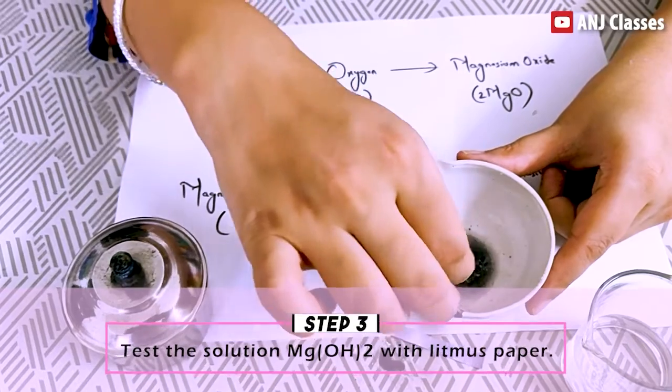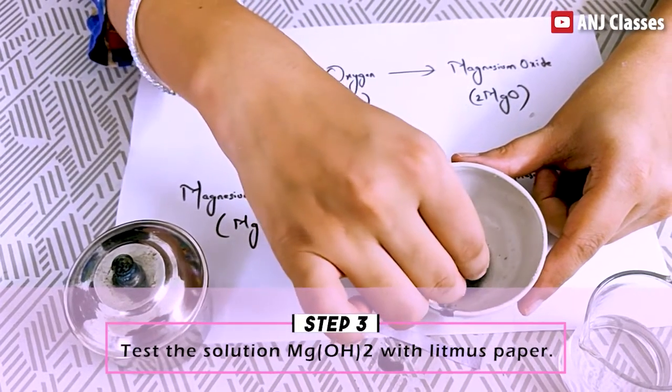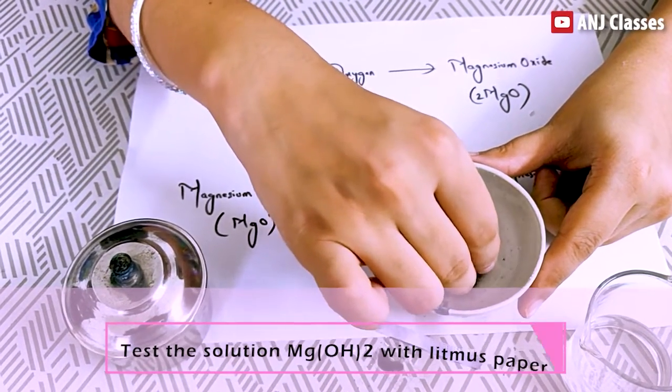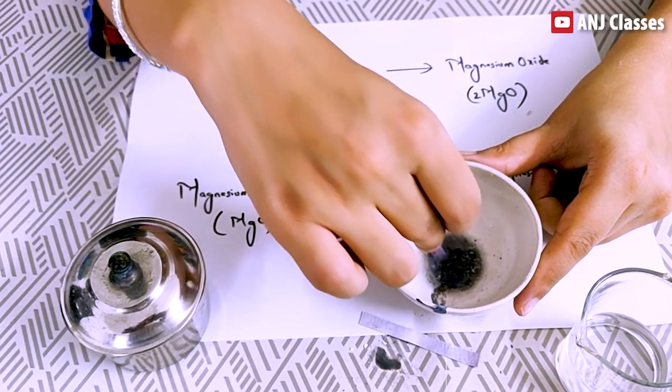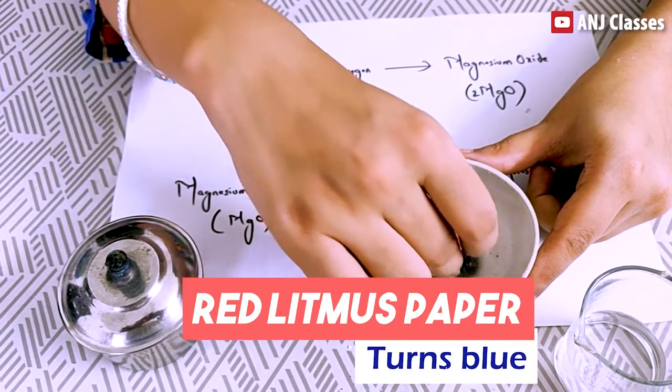Now I will test with red litmus paper. You will see red litmus paper. It turns blue.